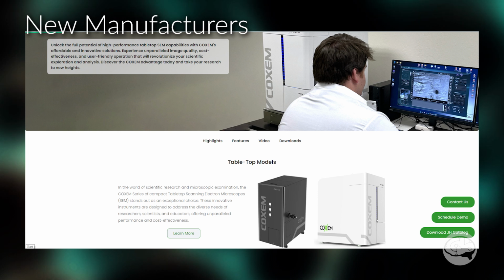They started off with just a tabletop and have since introduced a tabletop that can accept a Bruker EBSD detector. That was a big deal a year ago. They now have a small full-sized tungsten filament SEM. They were at the show and they had those things on display. I've interviewed them in years past, but not this year.